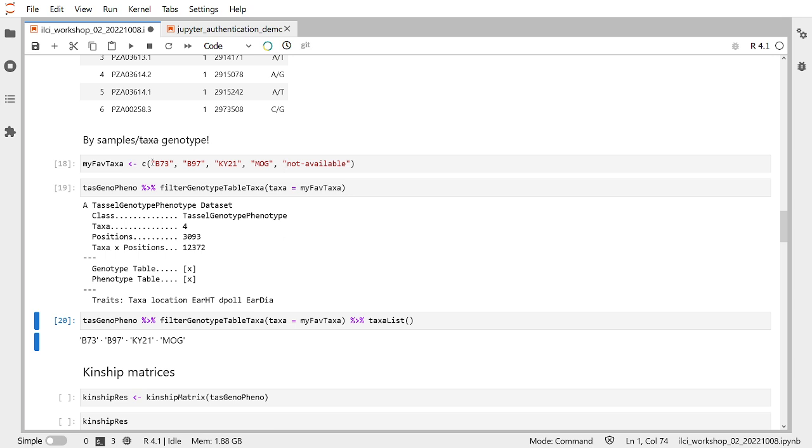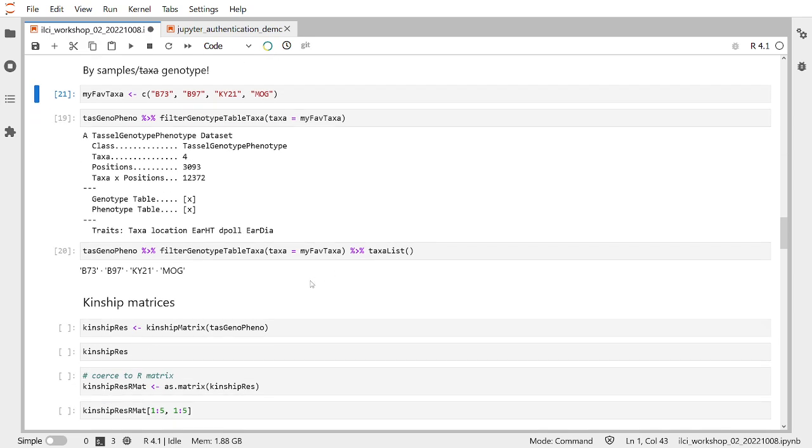It will try to find as many valid sample IDs as are found within your collection, and it won't throw an error or exception if it can't find every single one. If it can't find it, it just won't return that. I'll just keep that for documentation purposes.